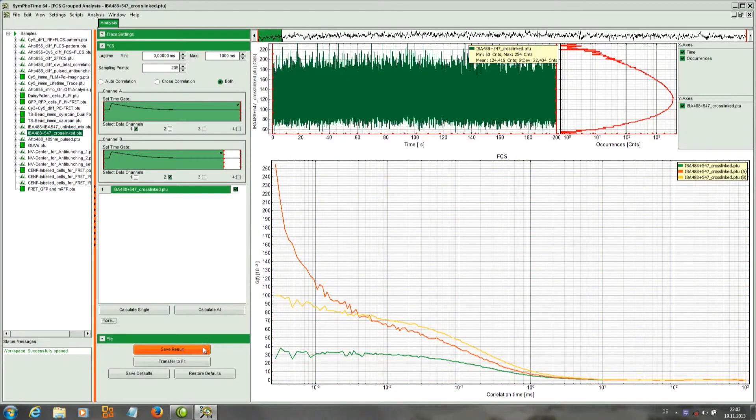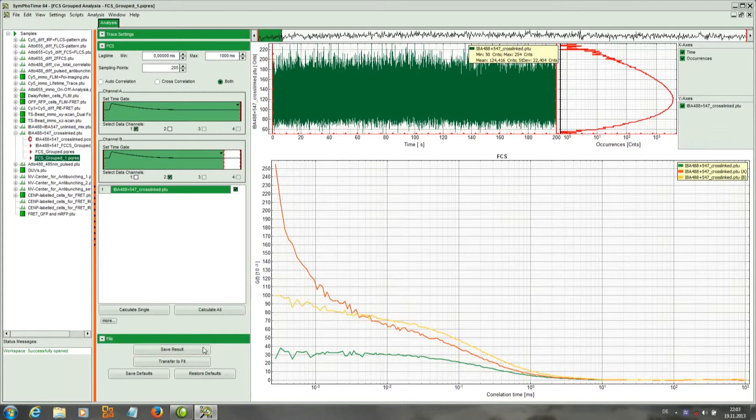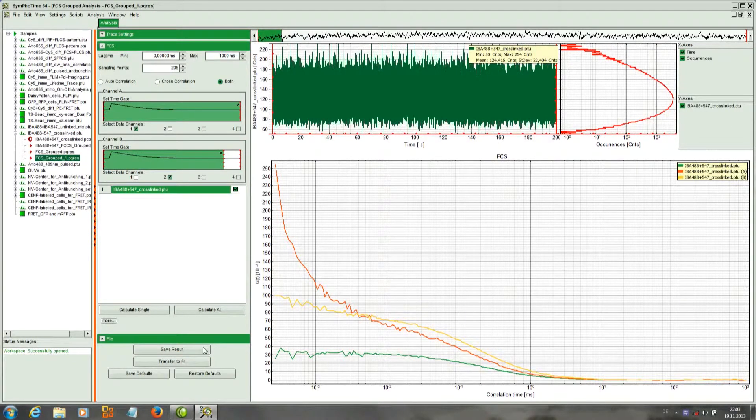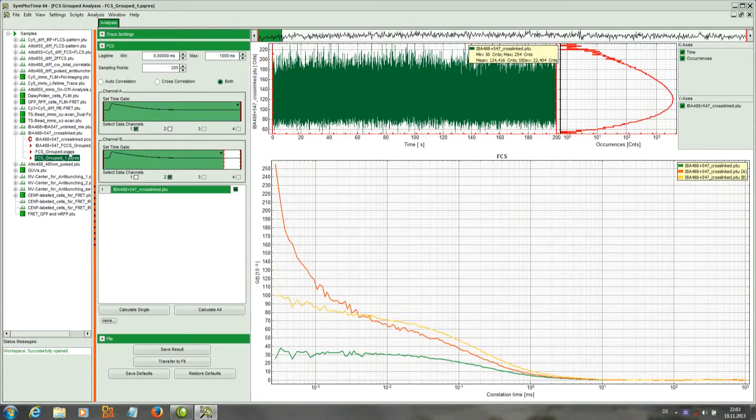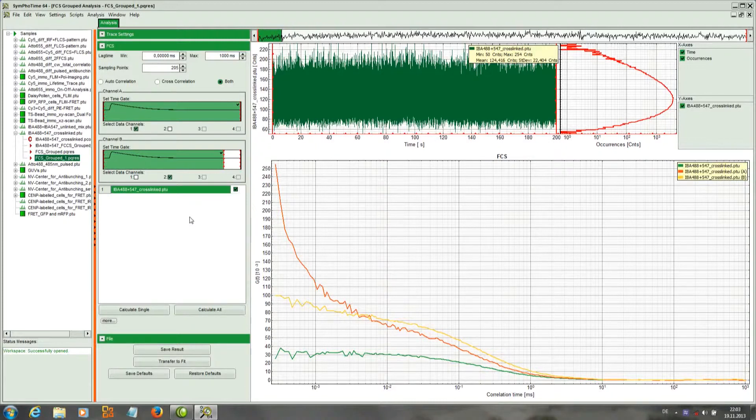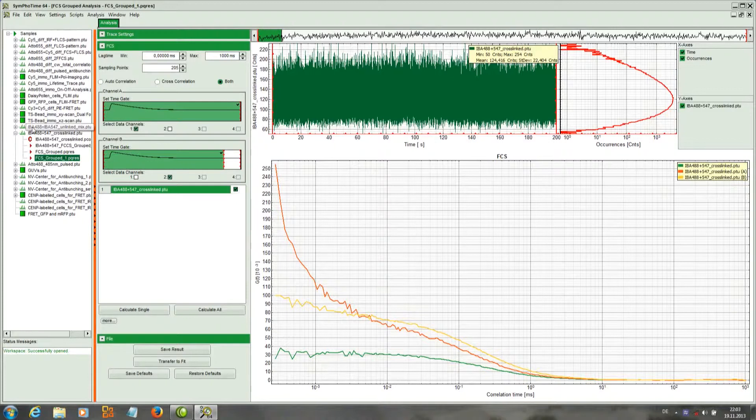We save these data and a new file is generated with the results. We will compare these data now with the results from another file.